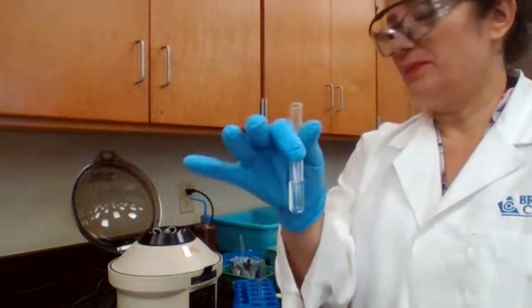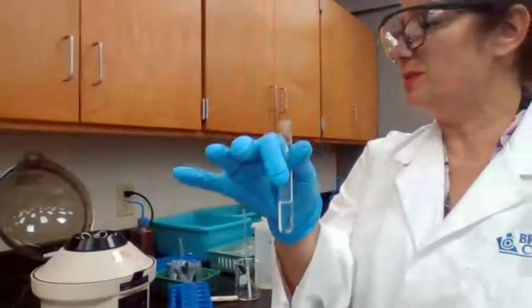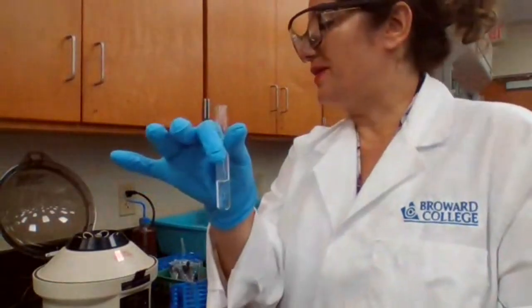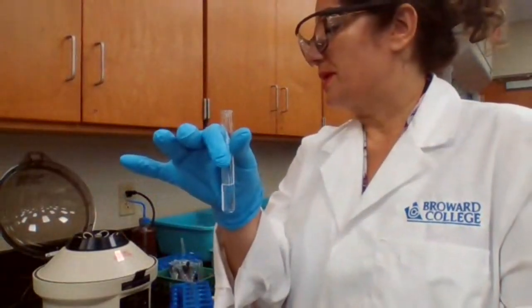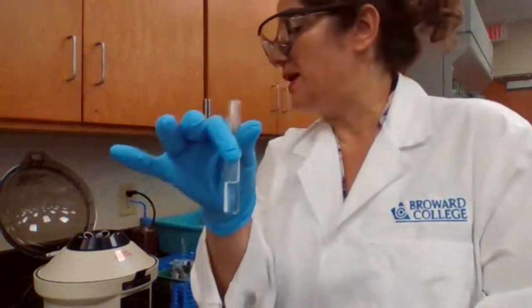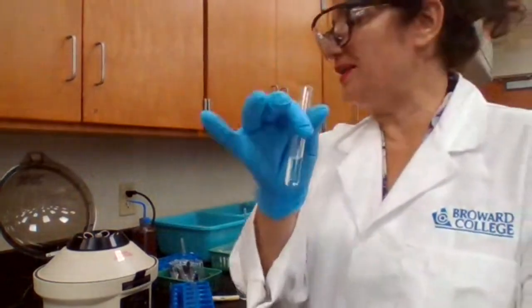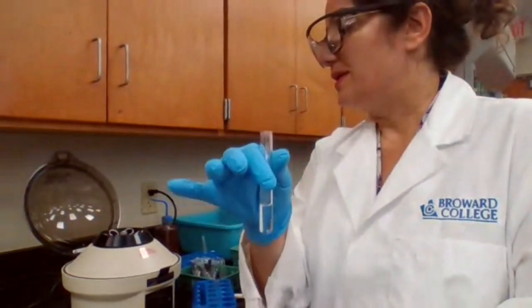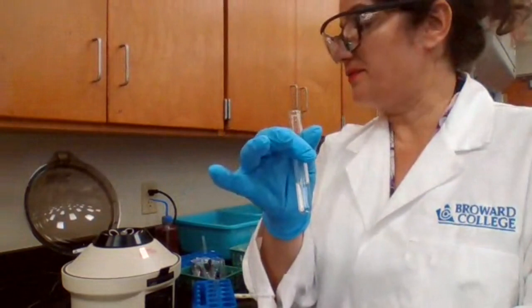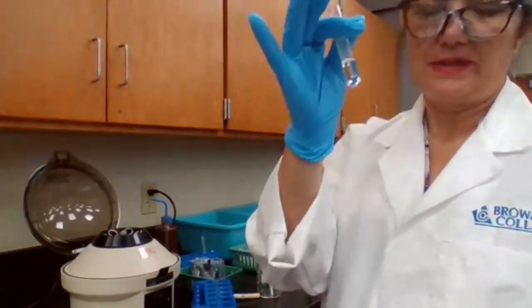In part E1, you're adding 6 molar nitric acid to this test tube, about 15 drops, and we want to know if the precipitate forms again or not. If a precipitate forms, that means we do have silver.